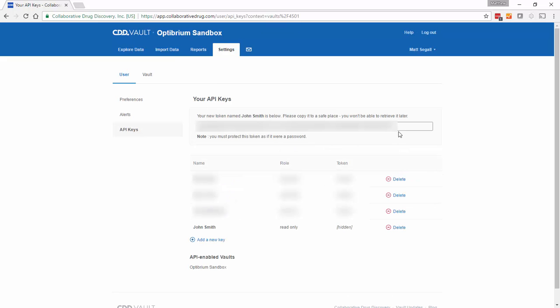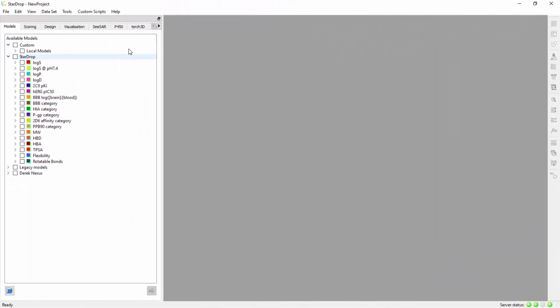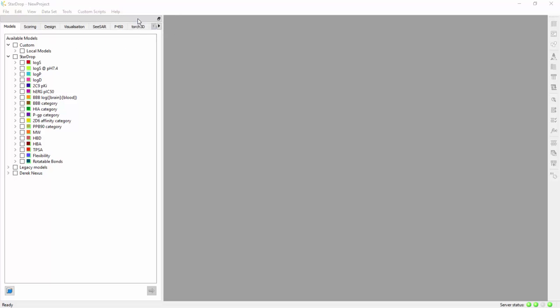Once created, the API key can be copied and then pasted into the box in StarDrop and it will be saved for future sessions.